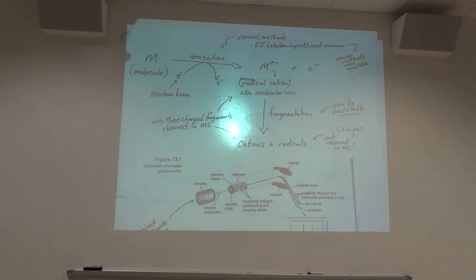This week in lab we'll be doing mass specs of the product. Each group will do a mass spec, GC mass spec. And then after that we'll have lab lecture during lab downstairs.